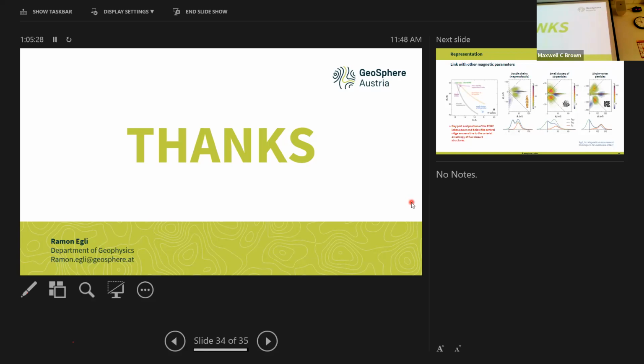So the total magnetization is defined as the integral of the FORC function over the entire space that you have measured. Numerically, you basically sum all the pixels and multiply by the pixel size, and this gives you the magnetization. And then the contour levels are chosen according to this total magnetization. You integrate outside of your contour so that these contours define a certain quantile of the magnetization.